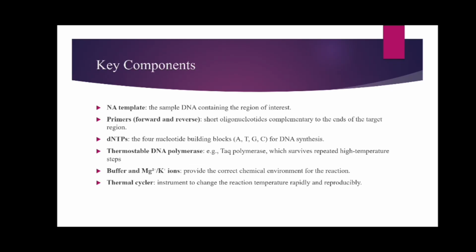Key components used in PCR: DNA template. The DNA template is the sample containing the specific region of DNA. Primers: we use both forward and reverse primers. And dNTPs, the nucleotide building blocks A, T, G, C, which help in the synthesis of new DNA.